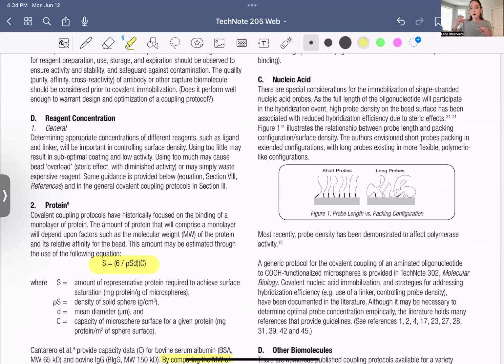You need to know how much of your ligand to add into the solution in order to cover each of those. Or if you're looking for not 100% coverage, adapt to that. Most likely you're wanting to get full coverage. And this will also go into getting a theoretical number of what to do to get 100% coverage. And then it gives you some tips about practically how you're going to get your best results because, unfortunately, there's always a little bit of a difference there.